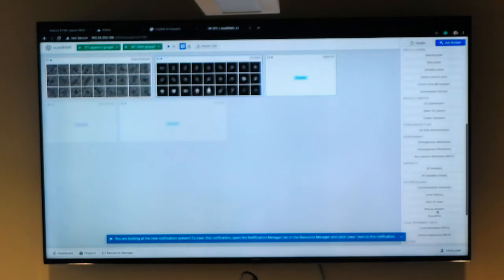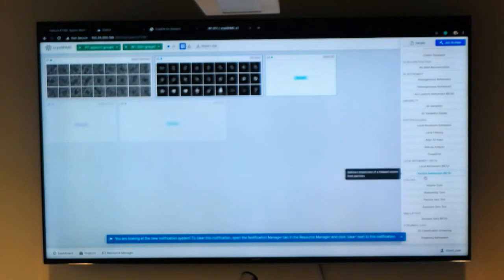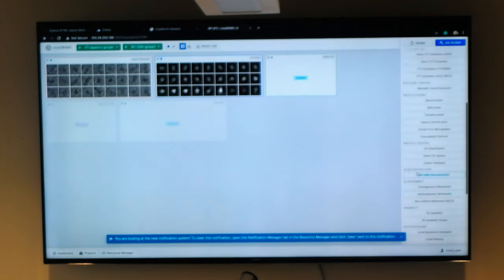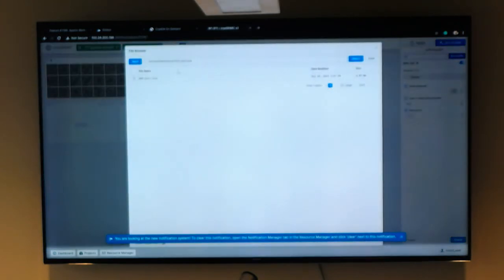Within the data set, in case you do decide to skip ab initio, but ab initio runs really quickly, you can import other things. We just imported a particle stack. You can import volumes and other things like that. So let's see, where is that? Import 3D volumes. We actually do have a 3D volume in this workshop data set. For example, these 3D volumes. So you can work with not just the binned data set, you can work with the unbinned data set if you wish.